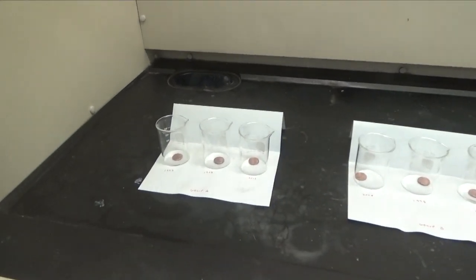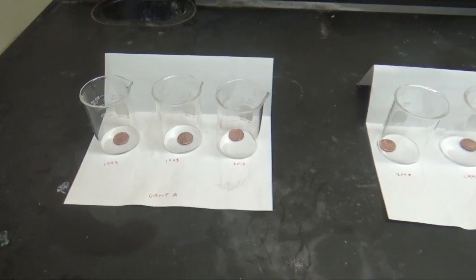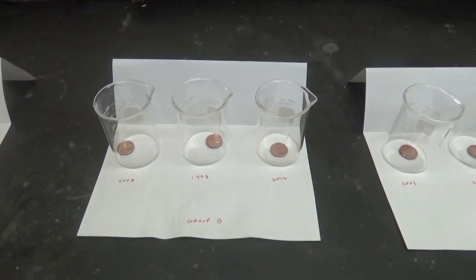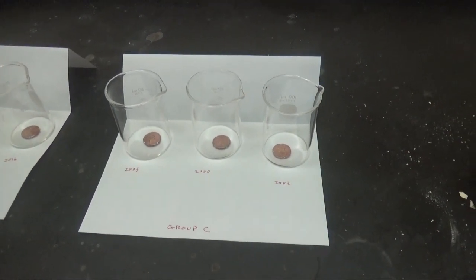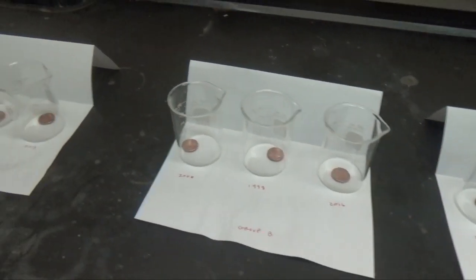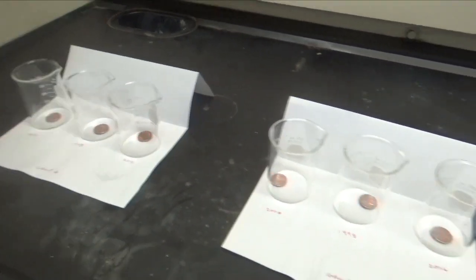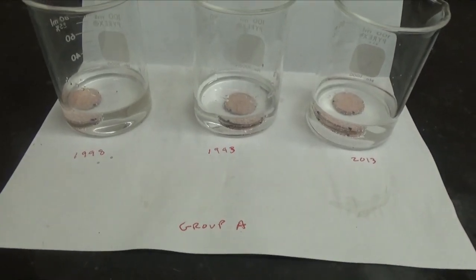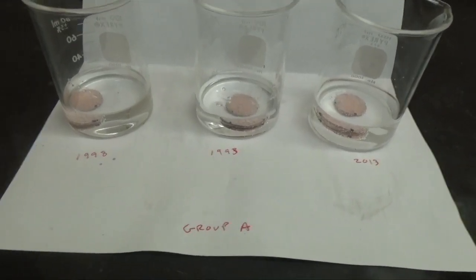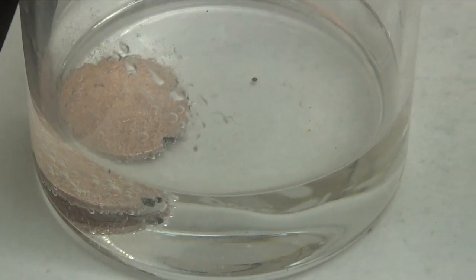I placed the pennies for group A into beakers, and for group B into beakers, and group C. I'm now going to cover each of these pennies with about 20 milliliters of the 4 molar hydrochloric acid. As you can see, the pennies are now reacting. This is group A's pennies. You can make observations.